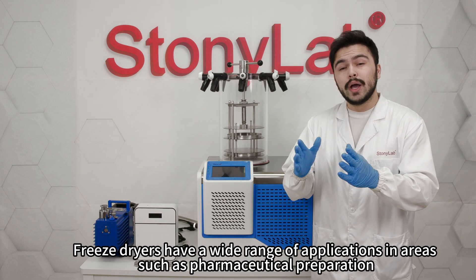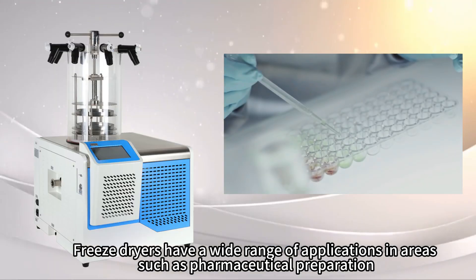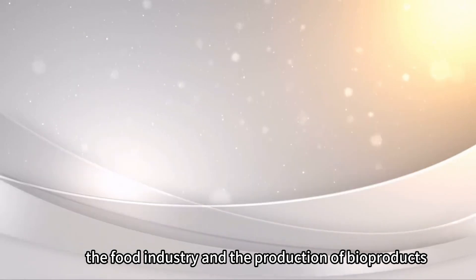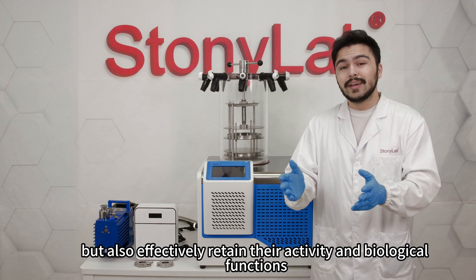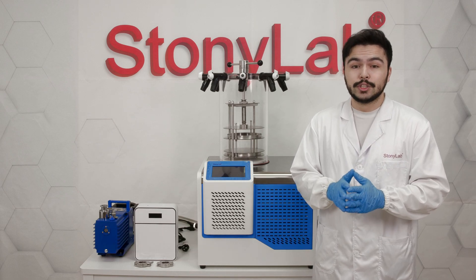Freeze dryers have a wide range of applications in areas such as pharmaceutical operations, the food industry, and the production of bioproducts. Samples that have been freeze dried not only possess long-term stability but also effectively retain their activity and biological functions.